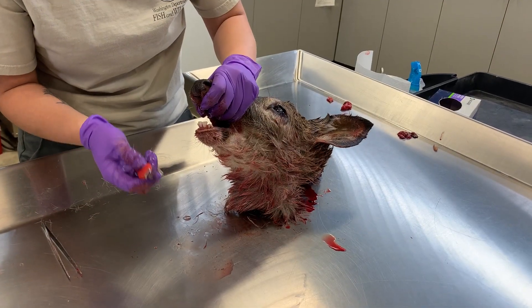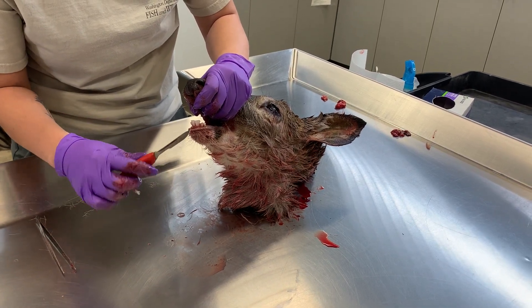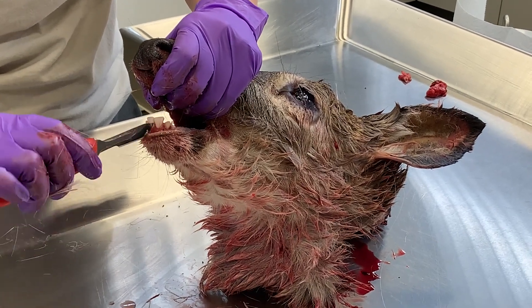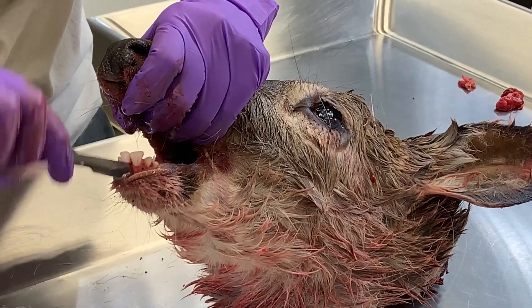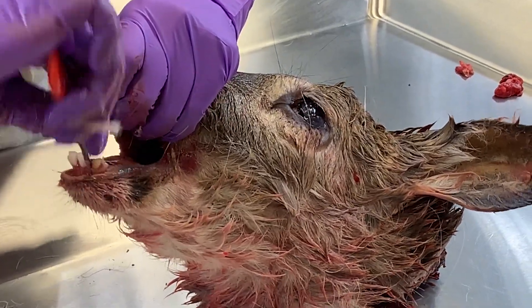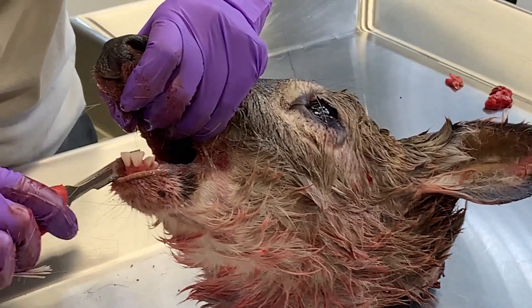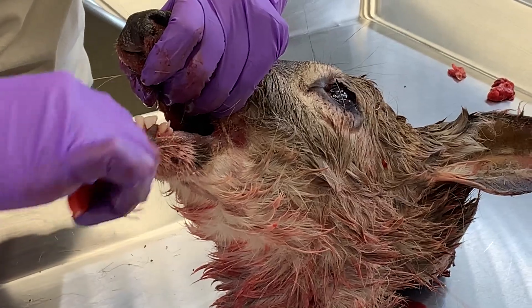The most important part, obviously, is that you're very careful with extracting the front two incisors. All you have to do is first take your knife and loosen up the tooth from the gum line. I'm just cutting between the teeth — just be very careful — loosening the gum line.